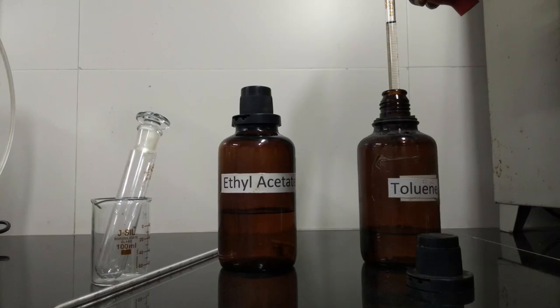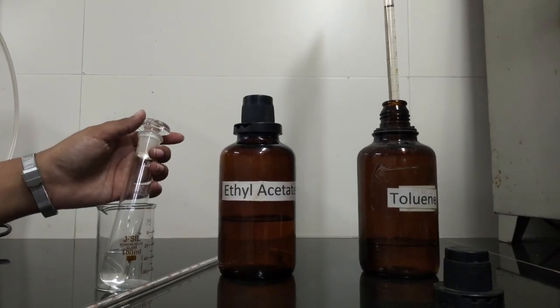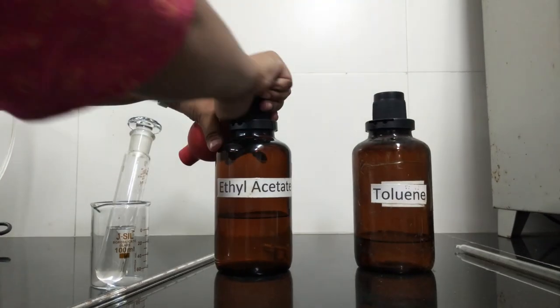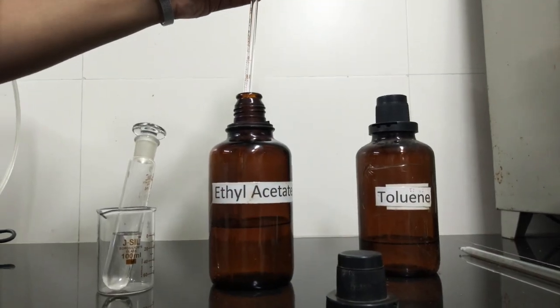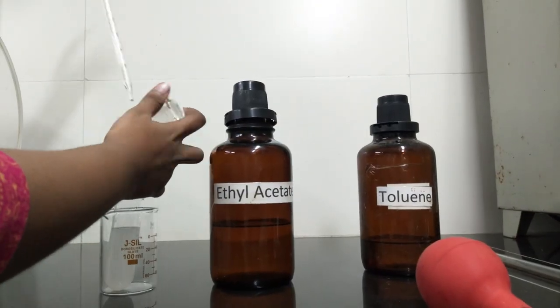Mobile phases used are organic solvents, toluene and ethyl acetate, in the ratio 18 is to 2 volume by volume. But why only these solvents? As terpenoids are volatile in nature, these two organic solvents are used.